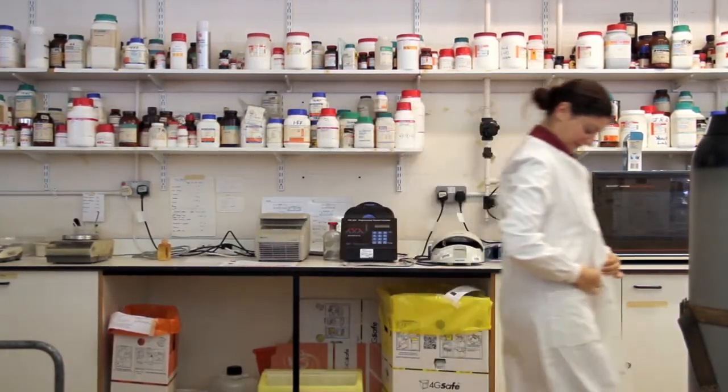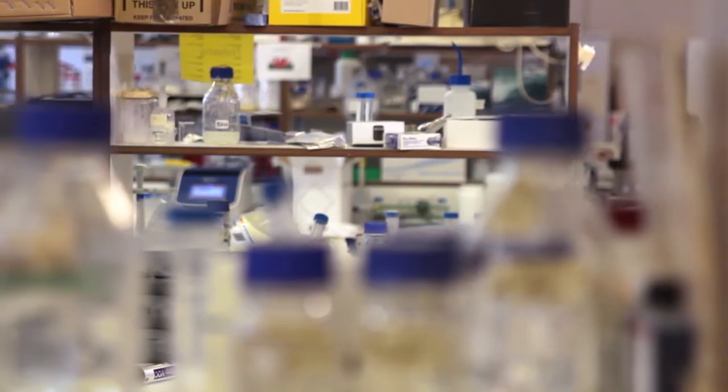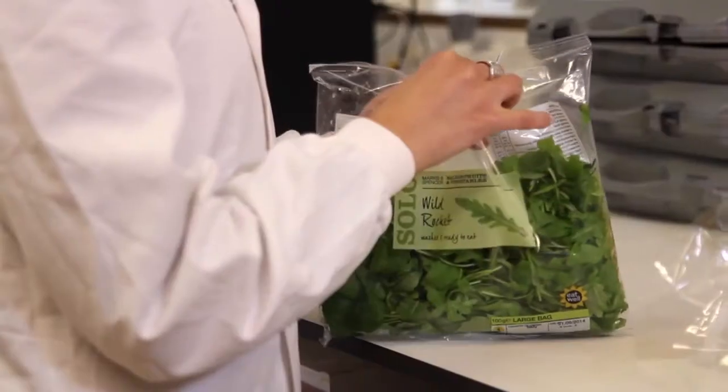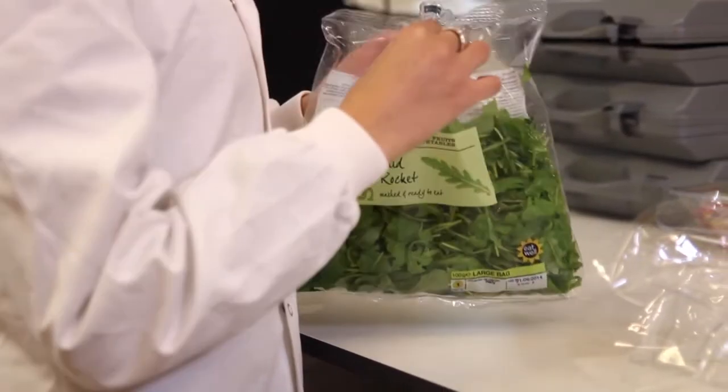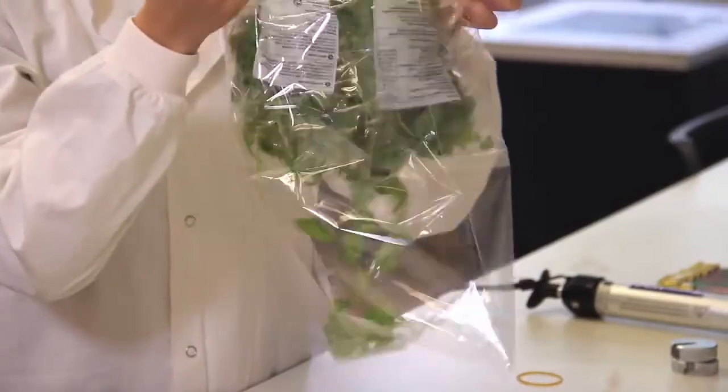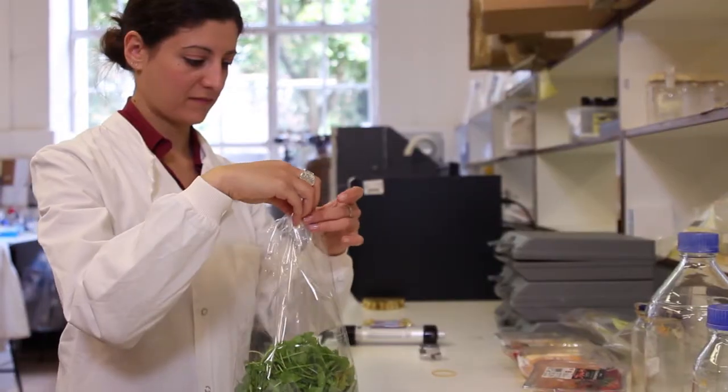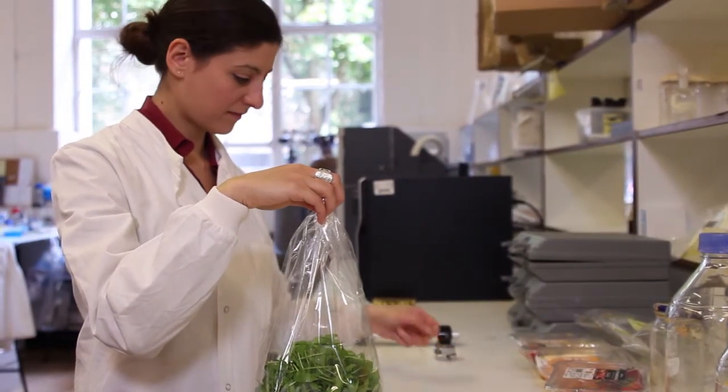The sampling process we developed for rocket and melon is very straightforward and simple. First of all, the sample is put into what is essentially an oven baking bag and this is sealed around a cutoff Eppendorf tube which acts as a sampling port.